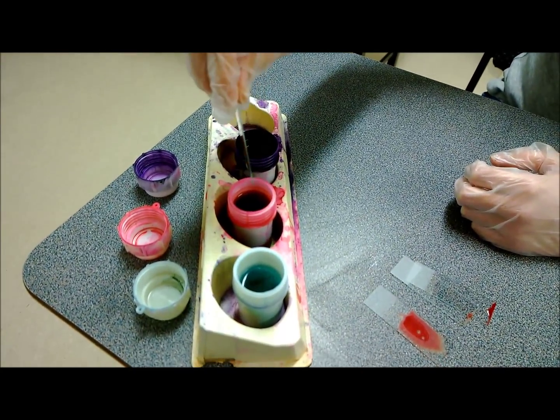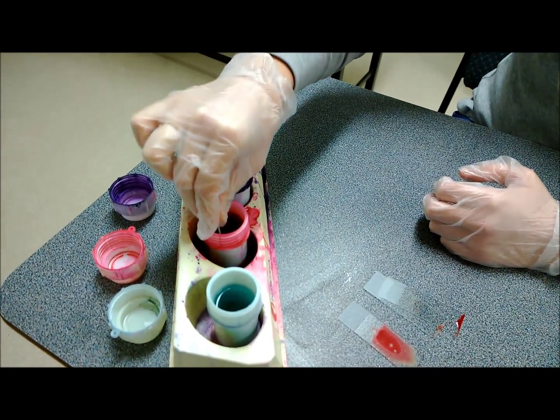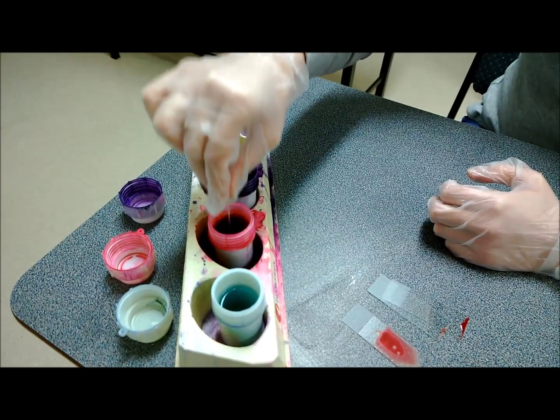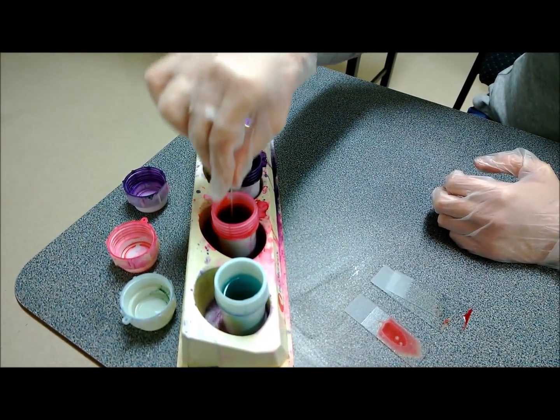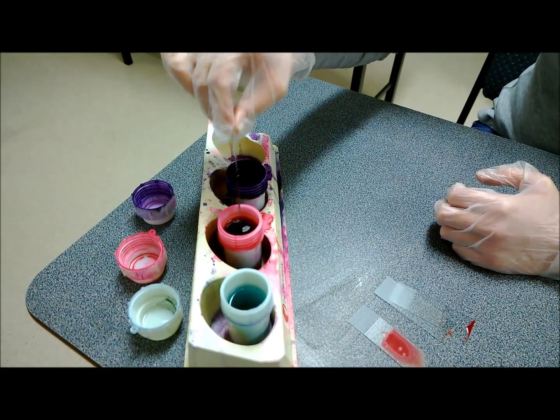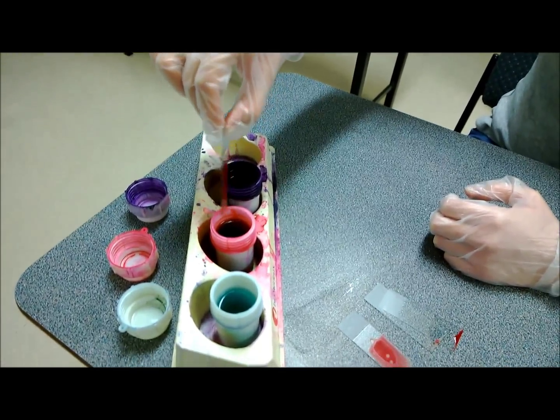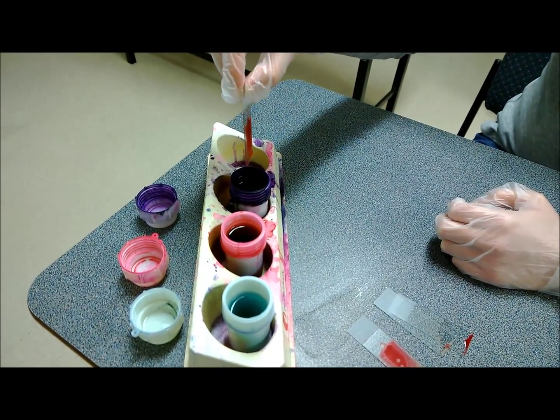And then you go into the red, which is dip one, for ten times. I also didn't count that, so we'll just say that was ten. And then you dip it ten times into Quick Fix 2.